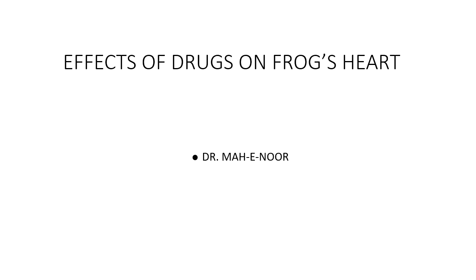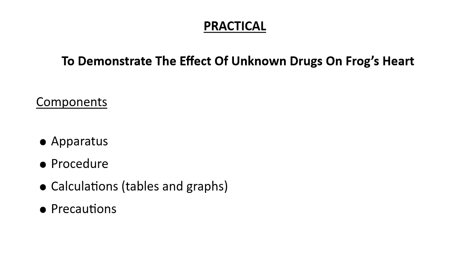Mah-e-Noor and today the topic of our practical is effects of drugs on frog's heart. The practical command is to demonstrate the effect of unknown drugs on frog's heart. The components that you have to write are apparatus, procedure, calculations including tables and graphs, and precautions.